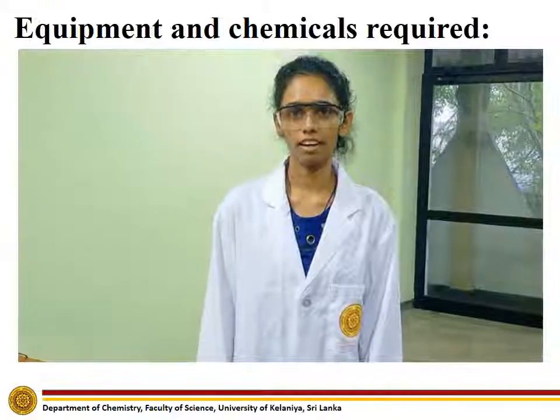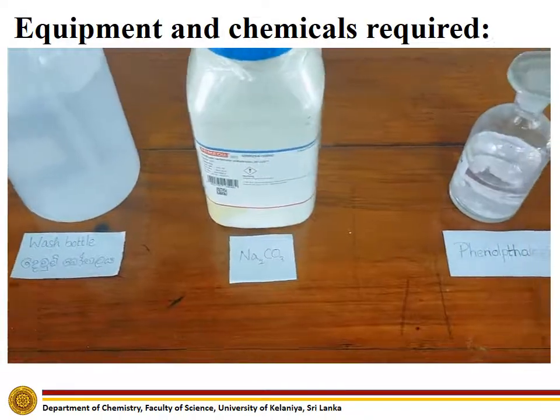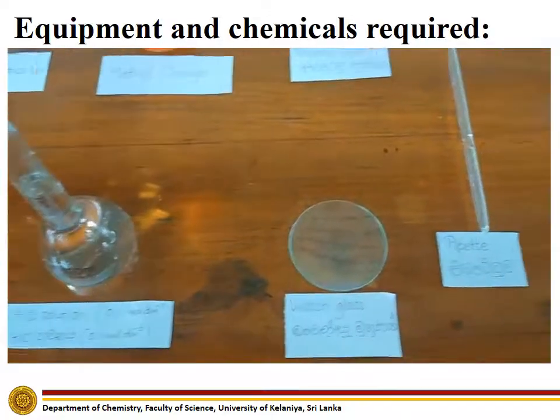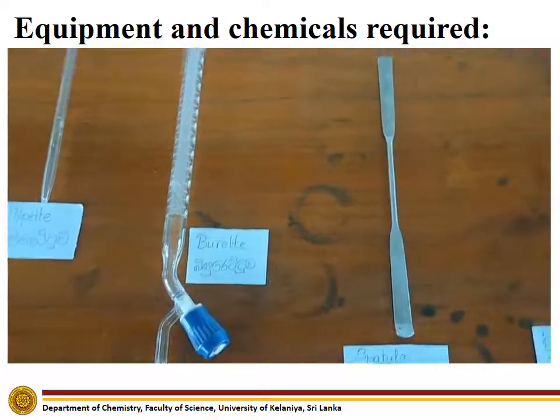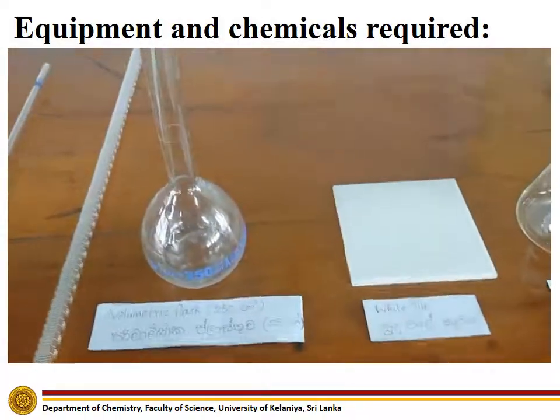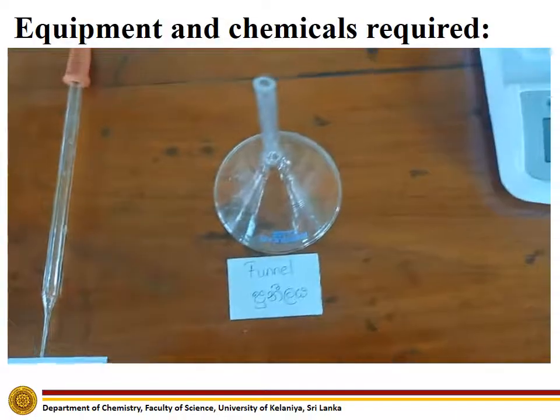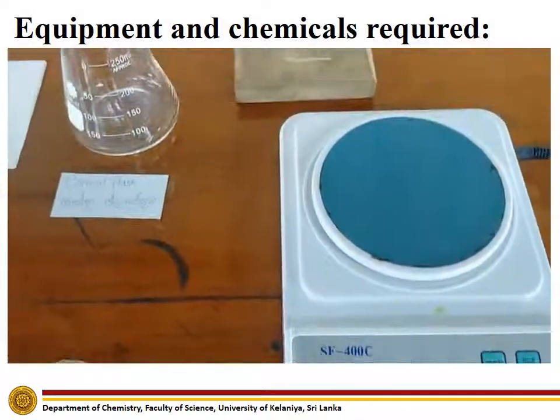The chemicals and equipment required to carry out this experiment are: wash bottle with distilled water, sodium carbonate, phenolphthalein indicator, methyl orange indicator, pipette bulb, hydrochloric acid solution, watch glass, pipette, burette, spatula, volumetric flask, white tile, conical flask, eye dropper, funnel, electronic scale, and sand.